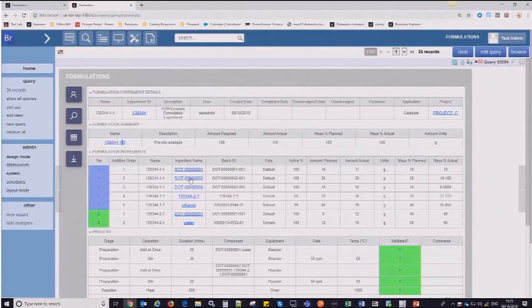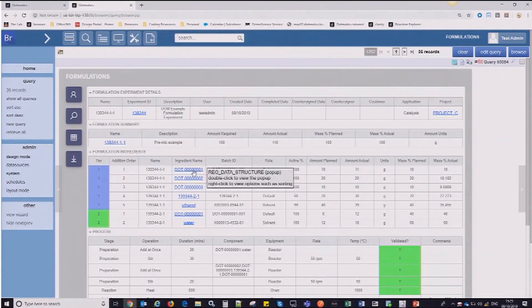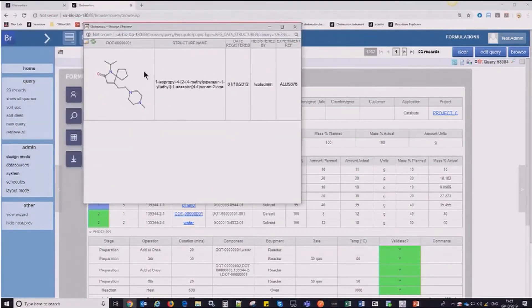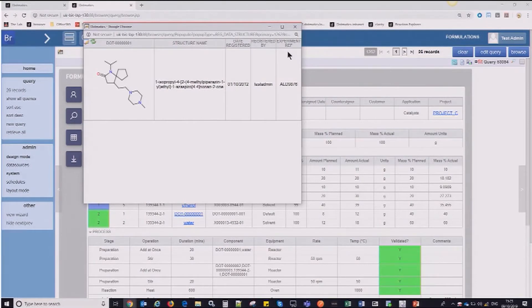Other features that we've included in this browser form are the integration with our Registry of Reagents project. So if you are interested in structures as a formulation scientist, you can also delve into the individual ingredients, see where they came from, when they were registered, if they were created in-house, for example.